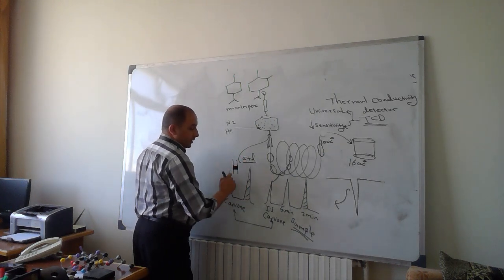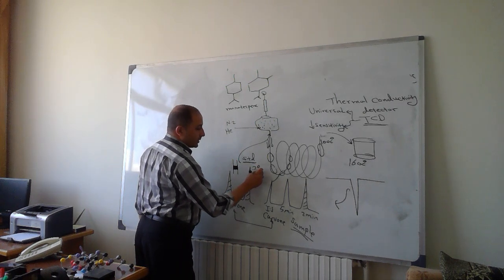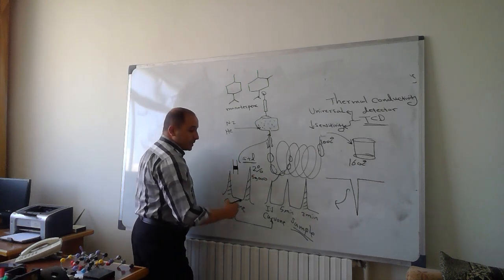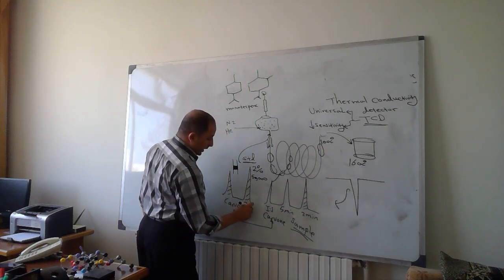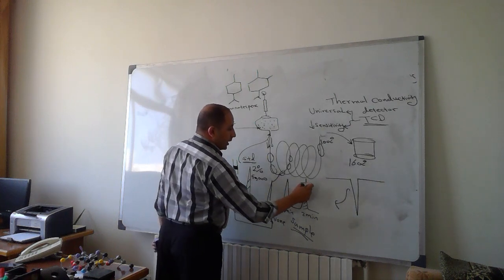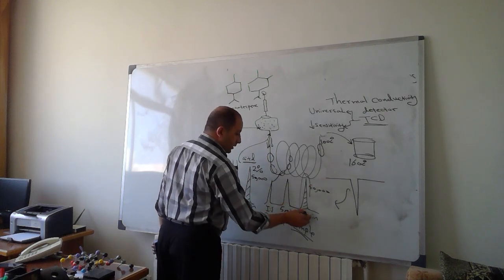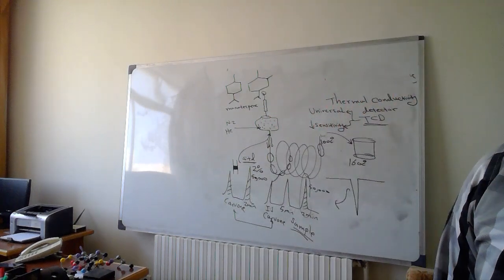If the standard of monoterpene has a concentration of 2% and it has an area under the curve of 50,000, the same area under the curve with the same retention time of 2 minutes will be for the same compound. For example, if the area under the curve is again 50,000, then definitely the concentration of monoterpene in the sample will be 2%. Okay.